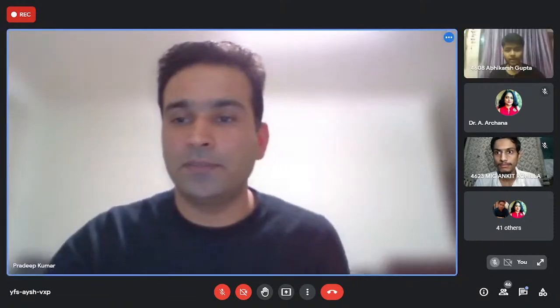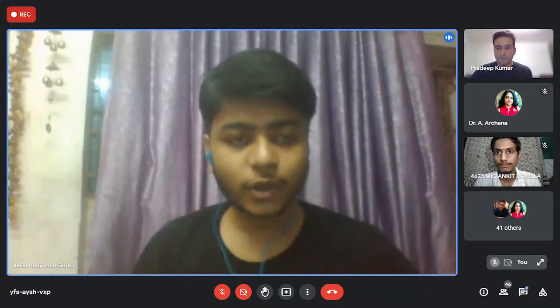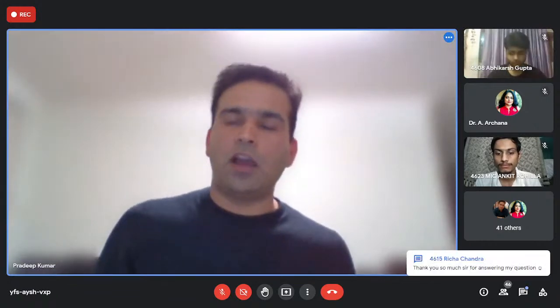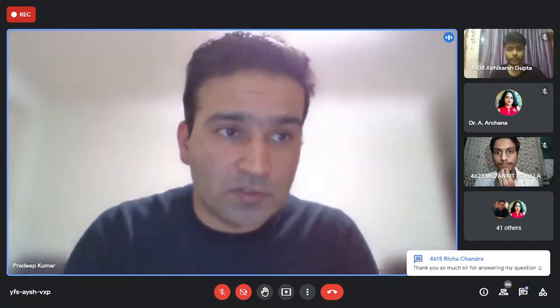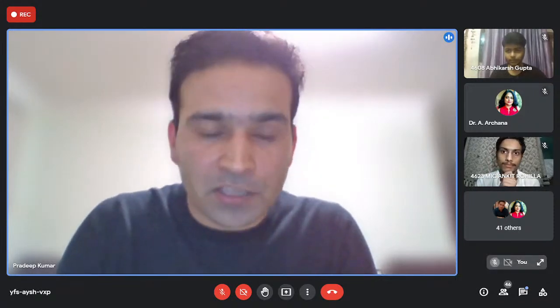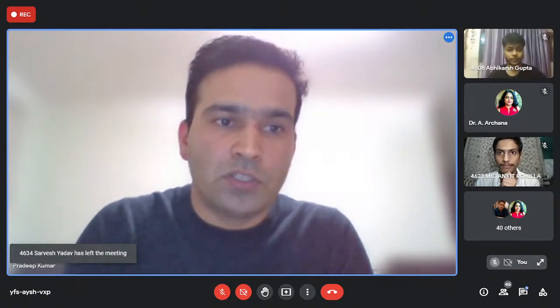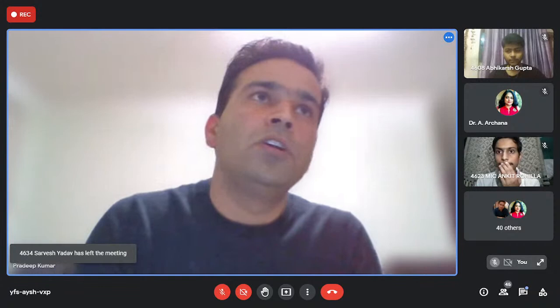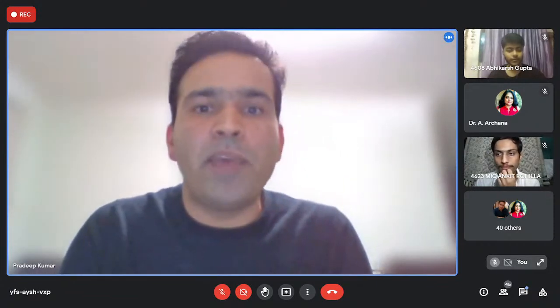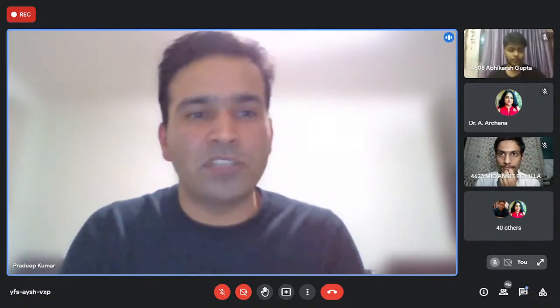Sure, please. So the next question is, will there be any discrepancy if the sample is not freshly prepared? Yeah, in a clinical setting, most samples are recommended to be prepared within 48 hours of their collection, and they should be well maintained for their temperature. That's for the clinical one. After staining is done, the best recommendation is to run your samples within 4 hours of staining, but it depends on the samples as well.